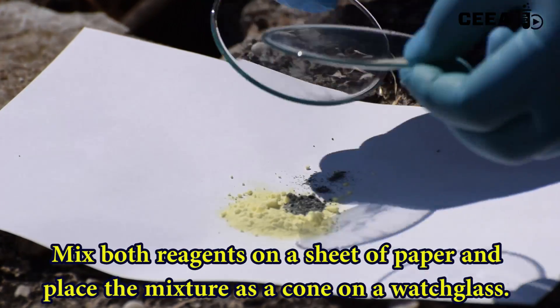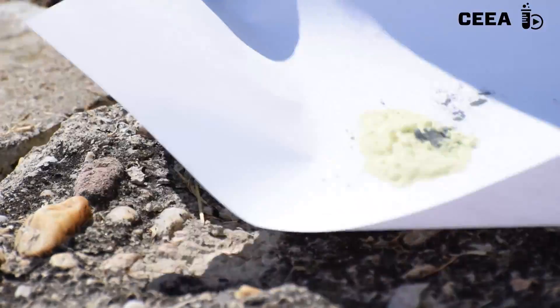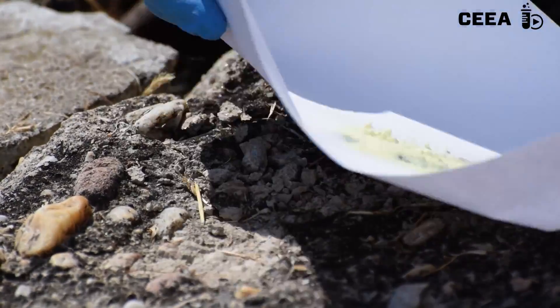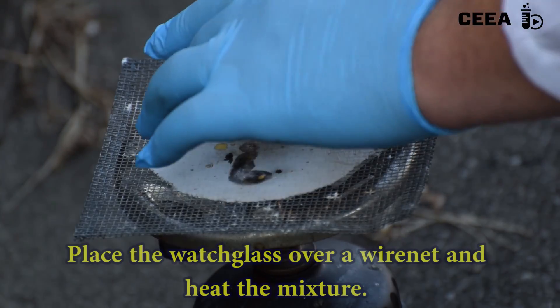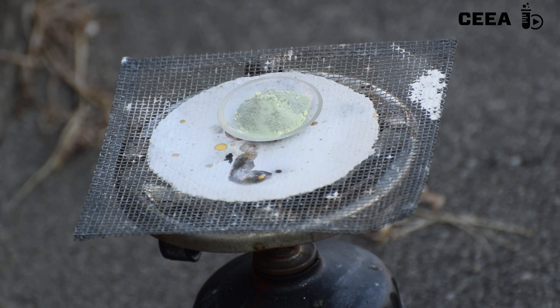Mix both reagents on a sheet of paper by moving them to and fro. Place the mixture on a watch glass or porcelain capsule and heat it over a flame.